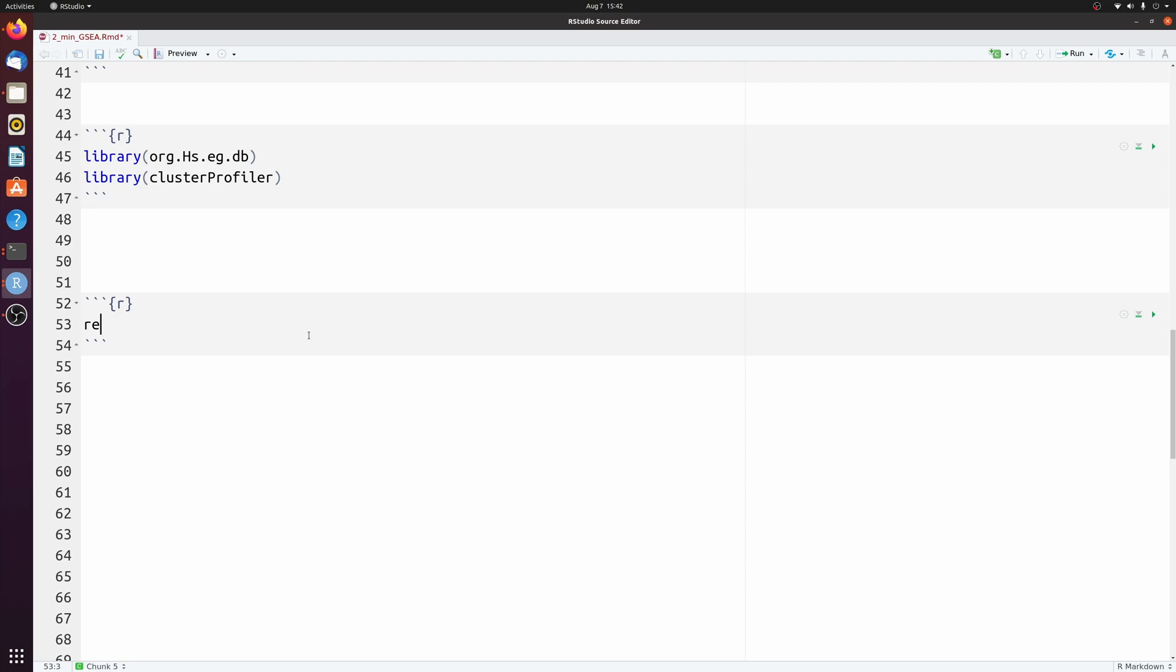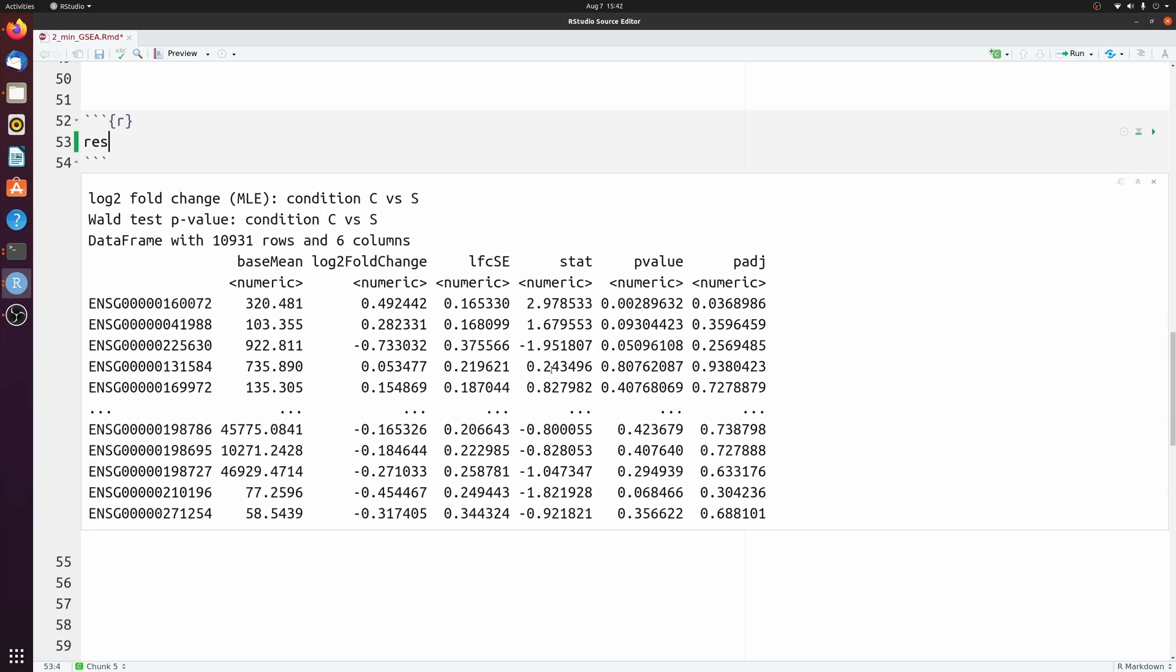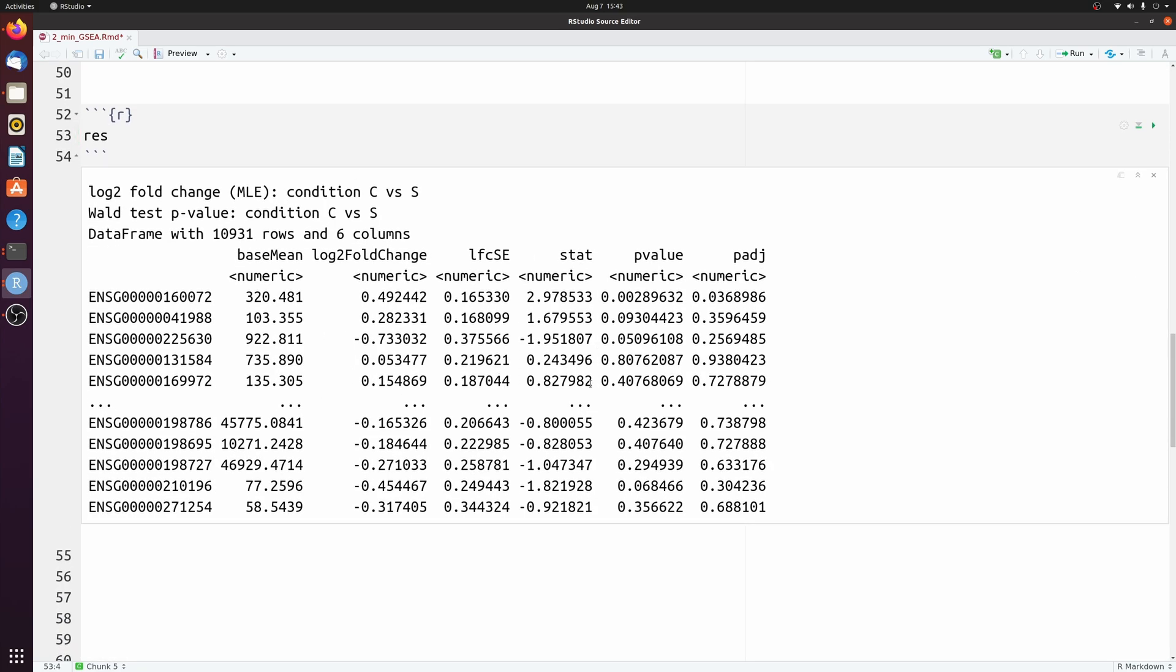If we look at res, this isn't ordered. What we need to do is order this. And for GSEA, people use a couple different metrics to order. A lot of people will just use log2 fold change.